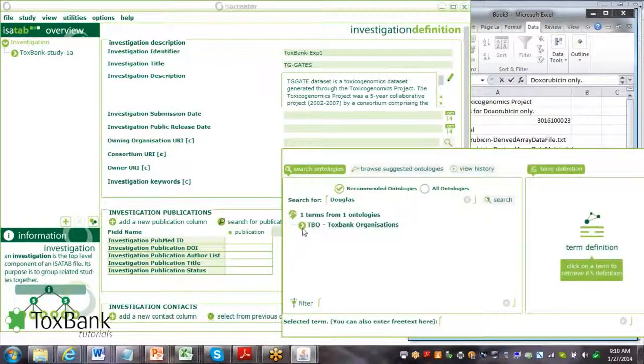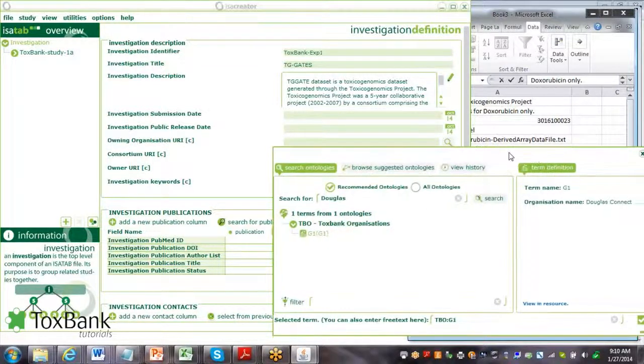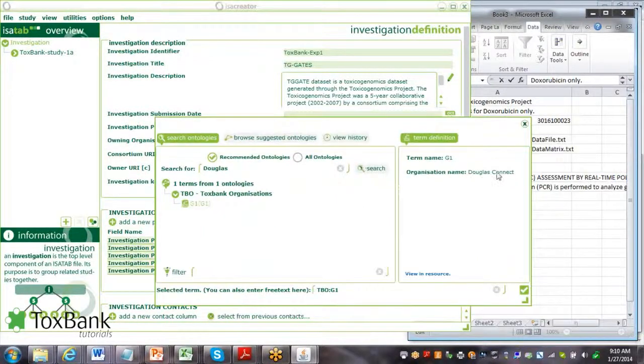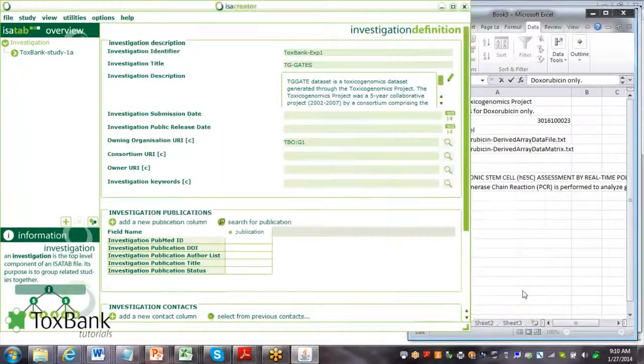It's found the organization, G1, and here you can verify that it's Douglas Connect. You click OK.